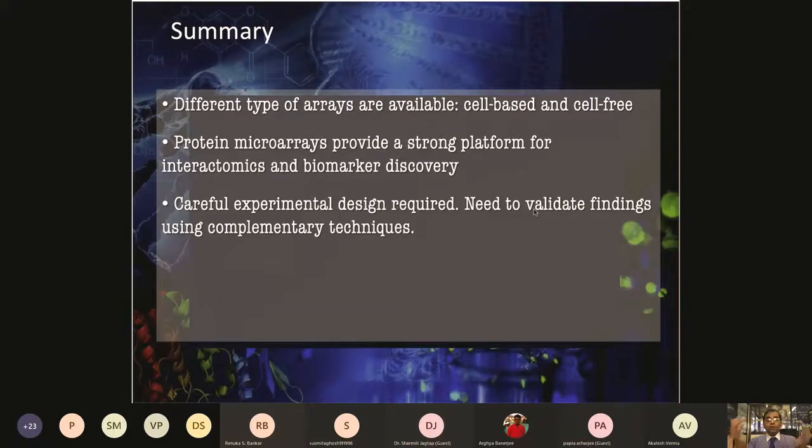Now you can narrow down those proteins, and you can print another array. Rather than having 30,000 proteins printed, you can maybe print 500 spots, which are of your interest. And now you can take some of the same samples which you have used from the 200. Maybe you can take 50 samples from that, and see whether it is making the same pattern. And also you can take 50 more new samples which can be used for validation, and that could serve as a validation set of the array.